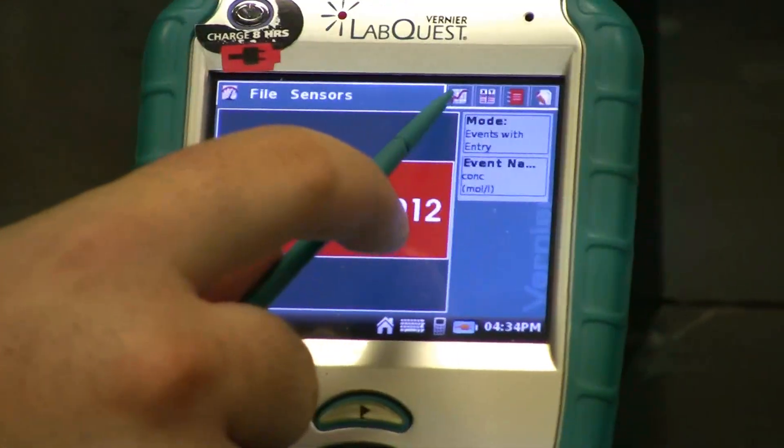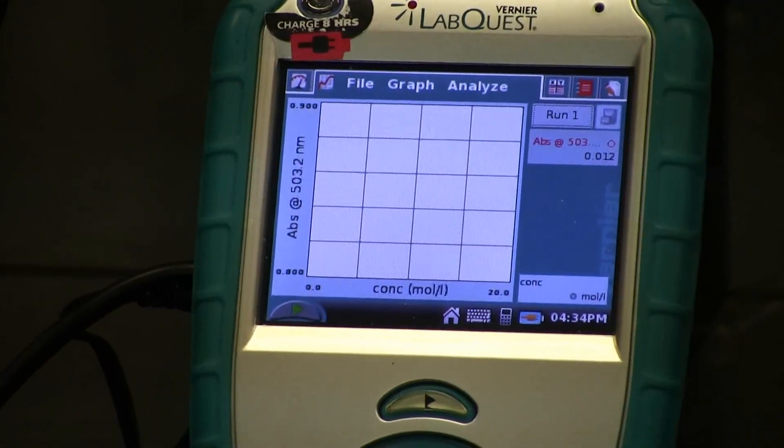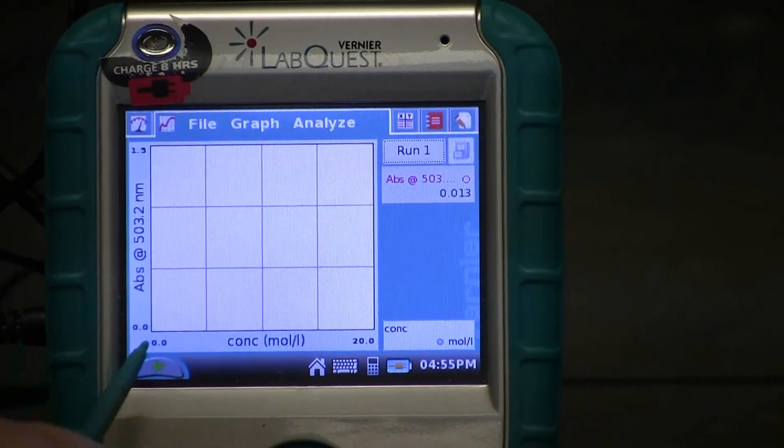Now, click over to the Graph tab. To begin, hit the Play button.